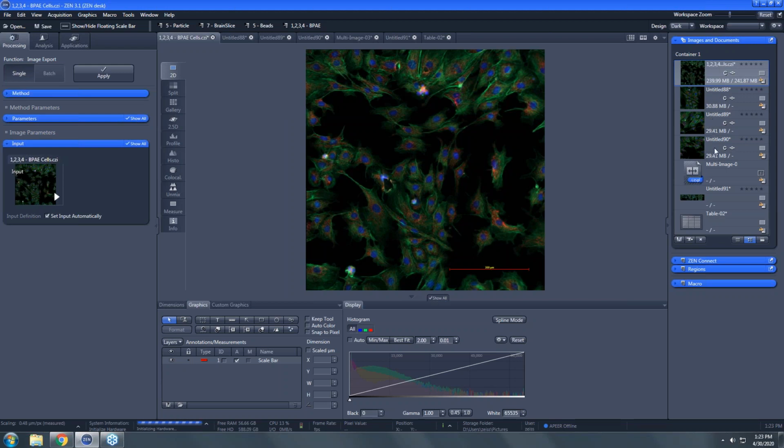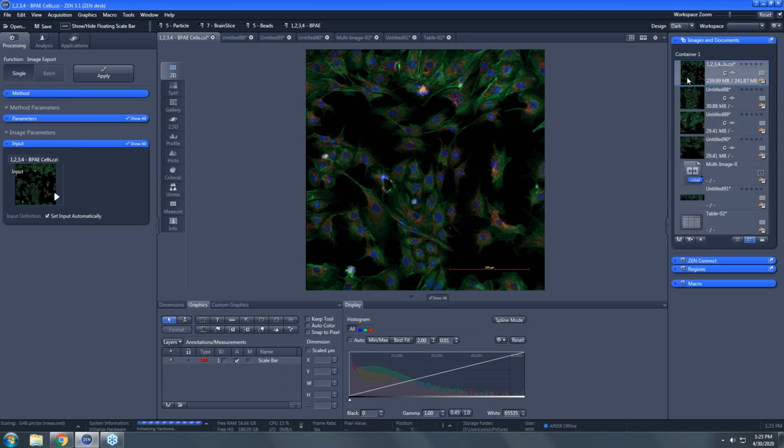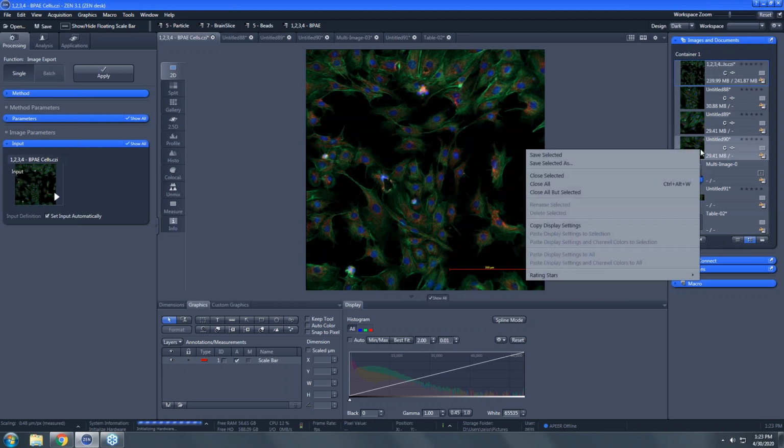There's a couple different ways you can close your objects that Nicole's going to show you. You can right-click and say close all in your shortcuts. You can highlight them all. The right-click was the way to go. There's a lot of different ways to close them all.